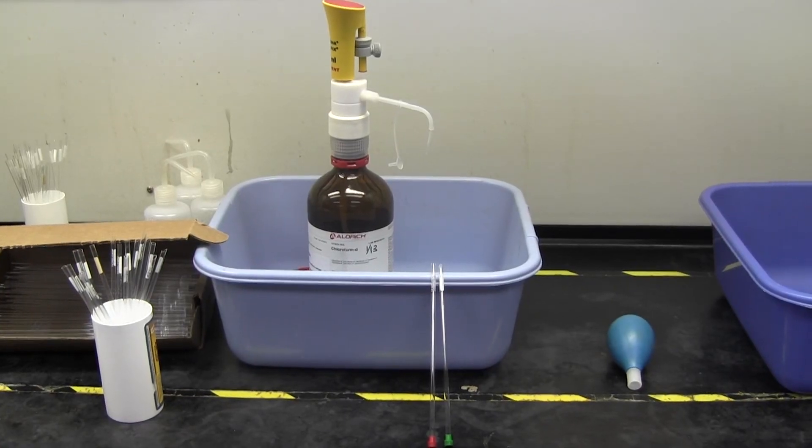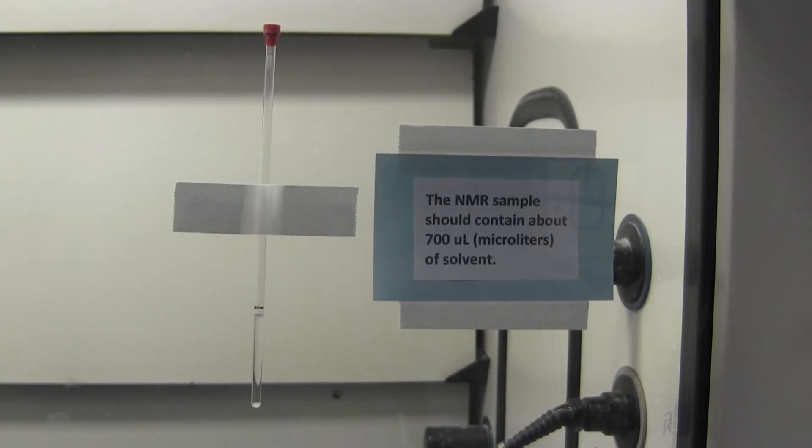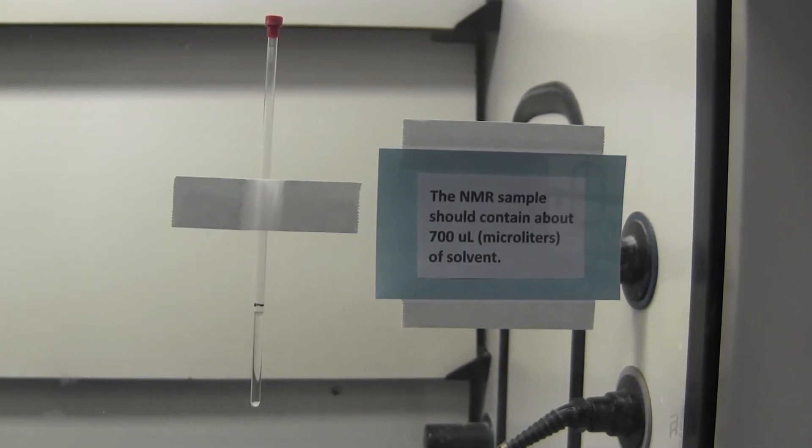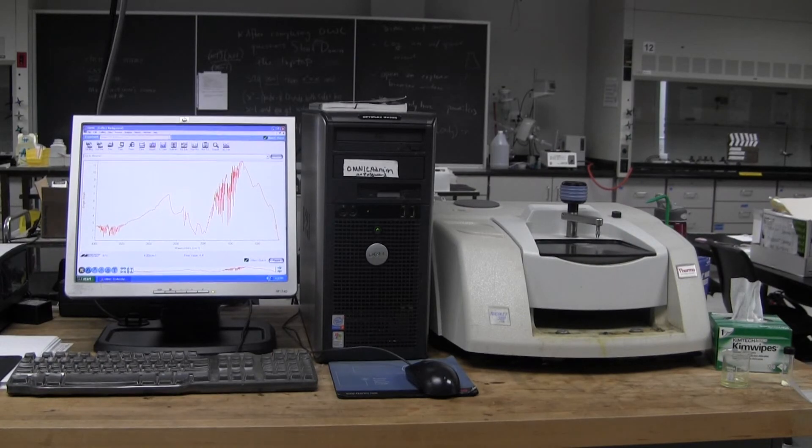Begin by preparing an NMR tube with your sample. You will use a few drops of this to obtain an IR. Directions on how to prepare an NMR tube are also posted on Moodle. Once you have the NMR sample prepared, proceed to the IR machine.